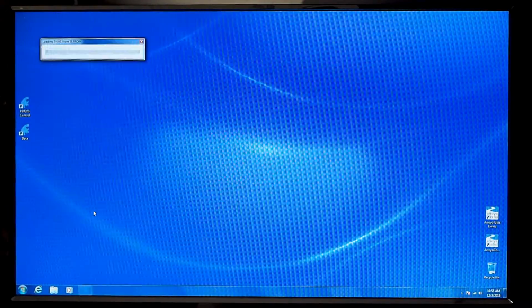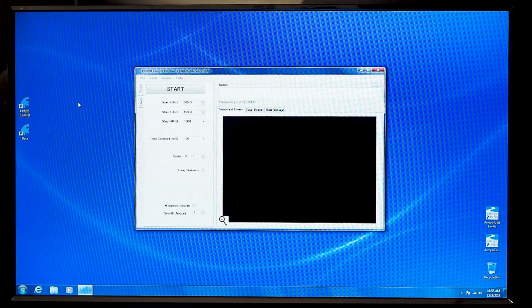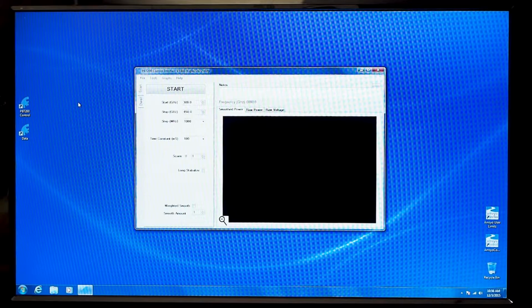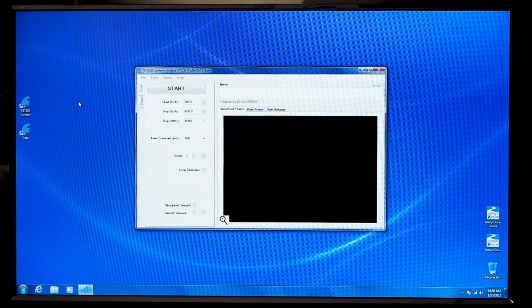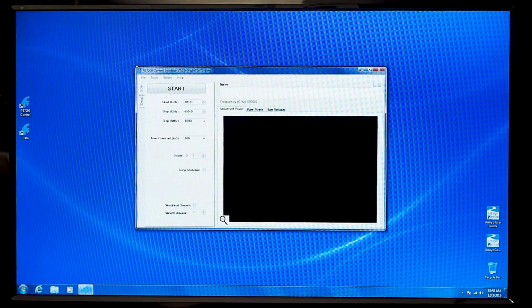So if you double click on that, first thing you'll see is the system communicating with the PB7220. This system has already been run on this computer and the calibration file has already been downloaded. If it is the first time, then it will take about 2 minutes to download the calibration file from the system to the computer, but after being done the first time, should not have to be repeated.